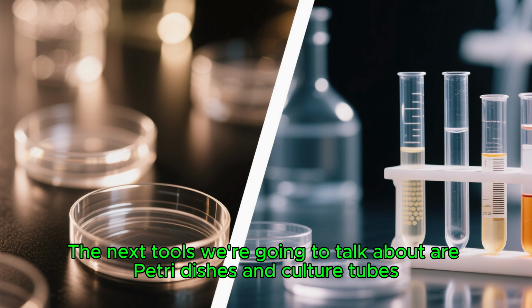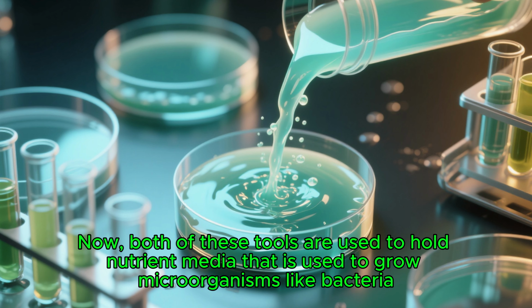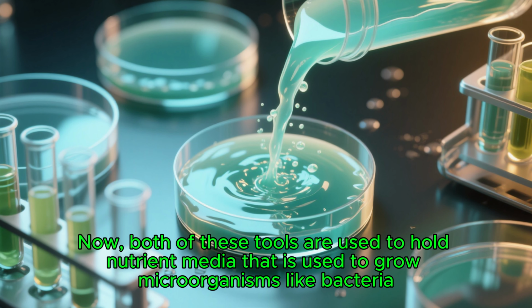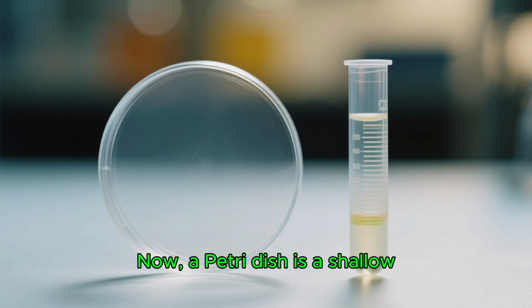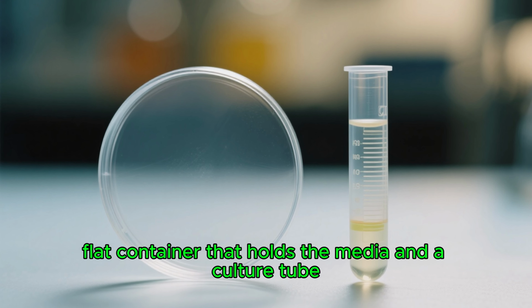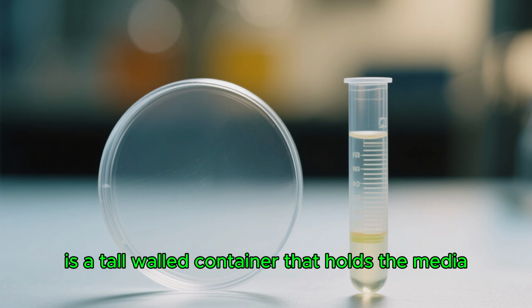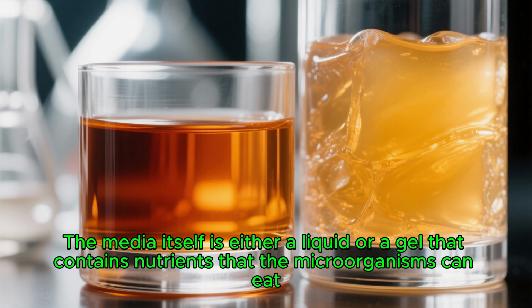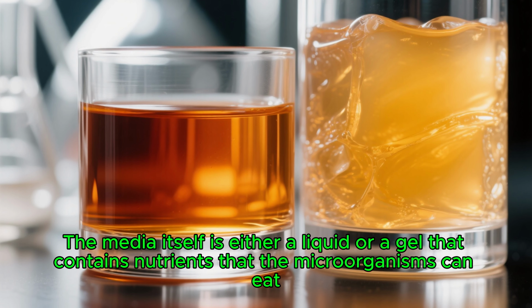The next tools we're going to talk about are Petri dishes and culture tubes. Now, both of these tools are used to hold nutrient media that is used to grow microorganisms like bacteria. Now, a Petri dish is a shallow, flat container that holds the media, and a culture tube is a tall-walled container that holds the media. The media itself is either a liquid or a gel that contains nutrients that the microorganisms can eat.